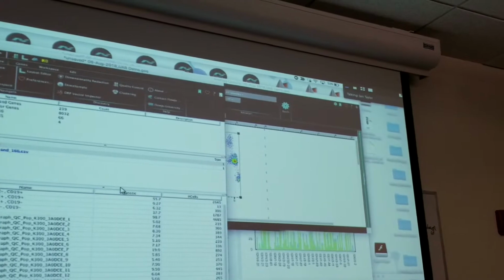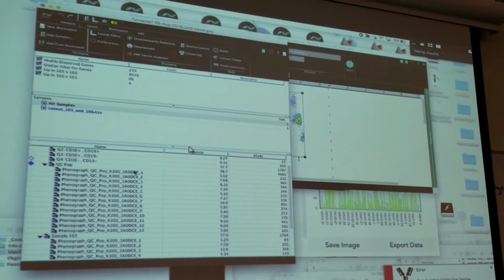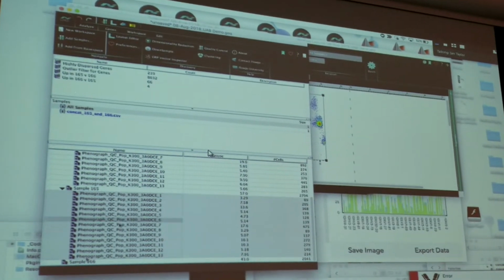Okay. It sounds like when we get to the point where we're looking for what V regions are in that sample, we would need a gene set that contains all V regions, which shouldn't be too hard to generate. Actually, I have an idea how we could do that already.